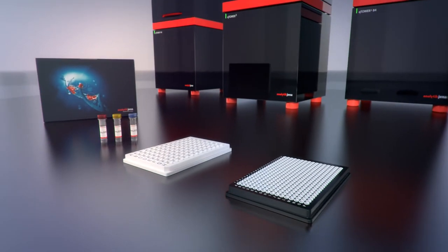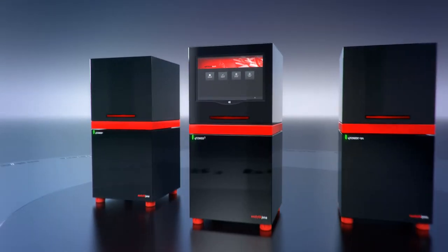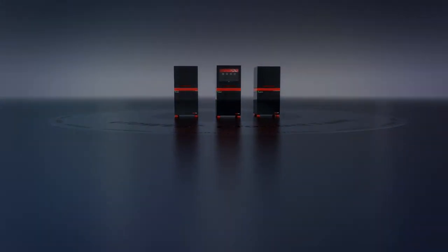Flexible use of different optical plastic materials and 10-year long-term warranty. Q Tower 3 G series for all real-time PCR applications with 10-year long-term care.